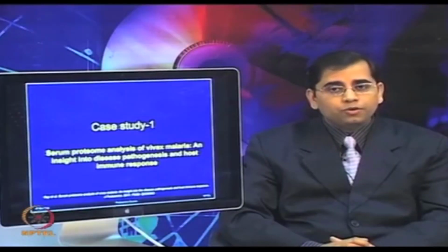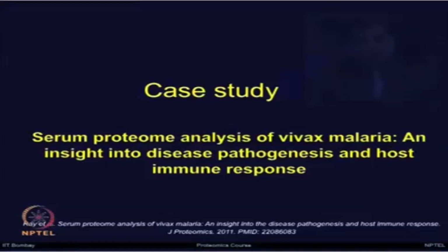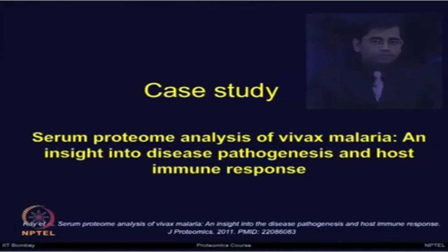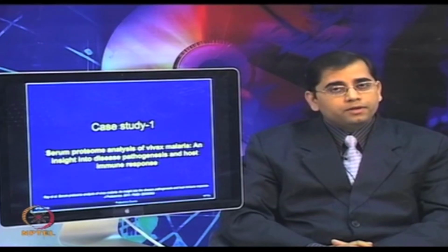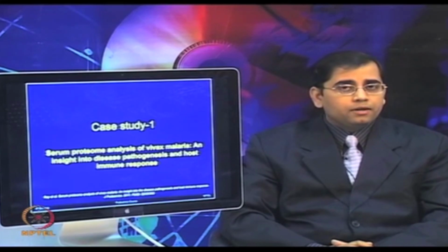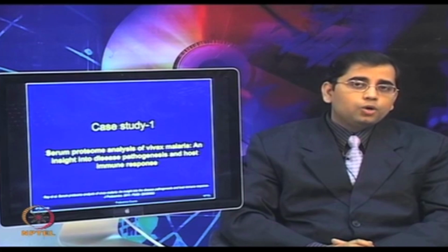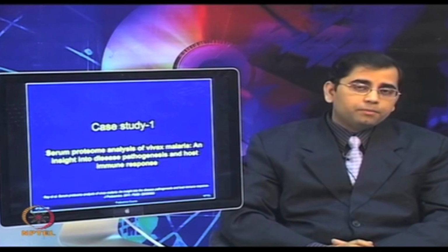Now, let us move on to the case study. In the first study, we will talk about serum proteome analysis of Vivax malaria, an insight into disease pathogenesis and host response, a study by Ray et al. So, this study was performed by my group, and we have tried to investigate the host response against malarial pathogen Vivax.